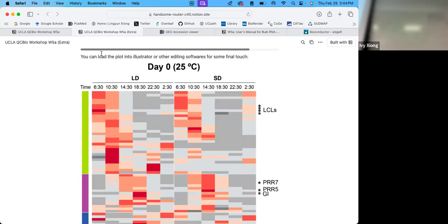I made it, but I think it's in my workshop folder, and not necessarily in the one for the day. That's when I got to this. And I moved things into. Right, so I would recommend to try the pipeline with all the folders created. For example, you do everything in your test folder.